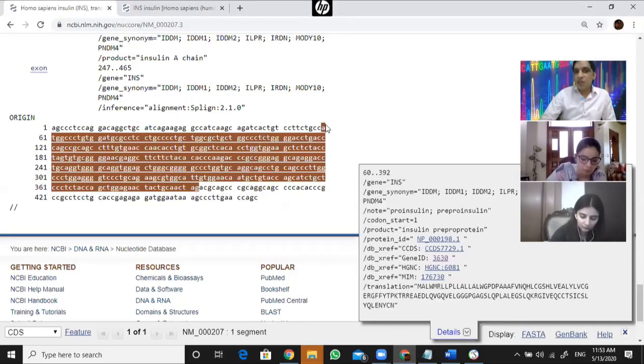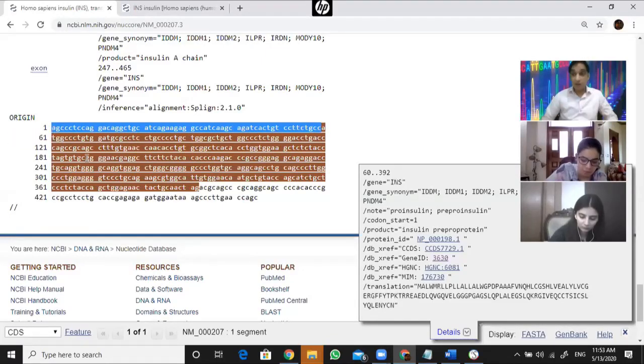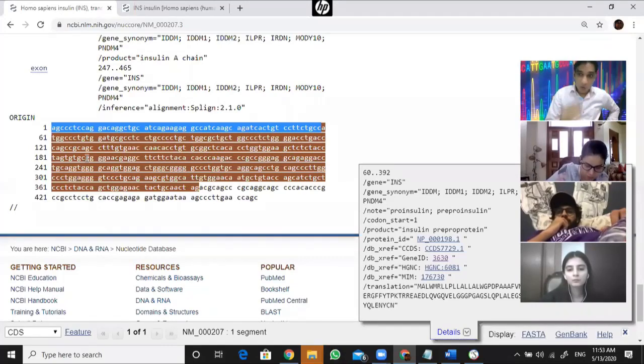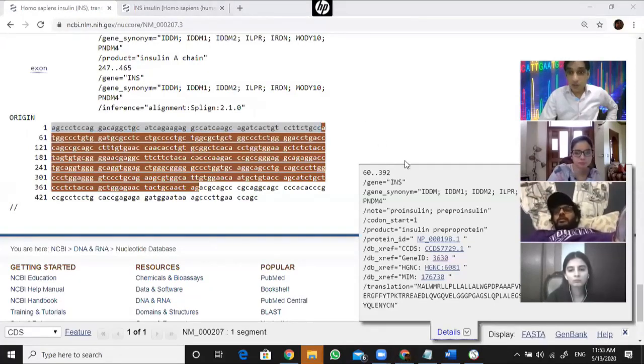Now, whatever the sequence present above that portion, what is that? Shabash. Answer. Text or voice. We'll do voice, I also have to open the text box, but that's fine. Whatever the sequence present above the start codon, so it is the promoter, says one student.